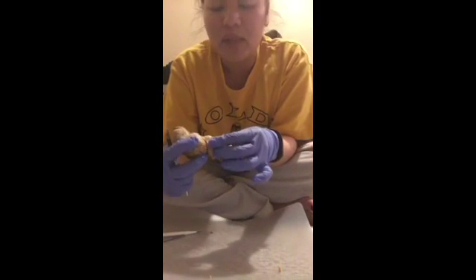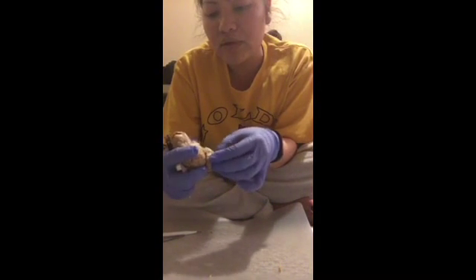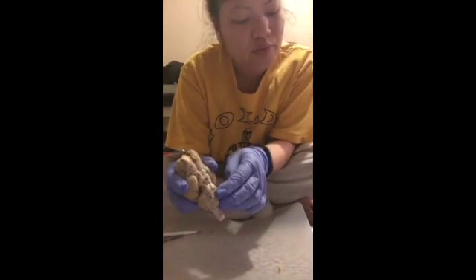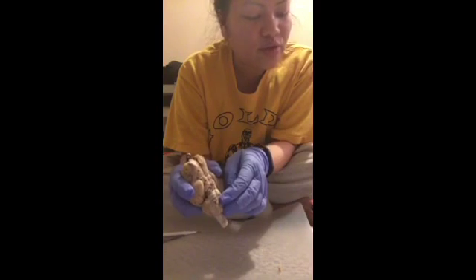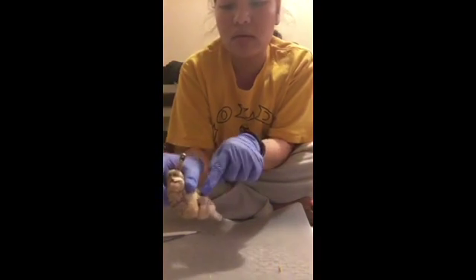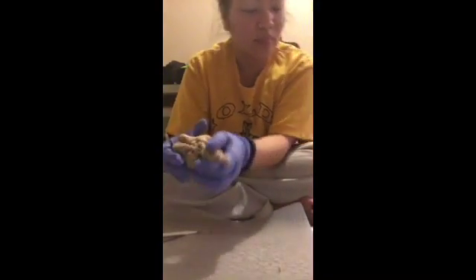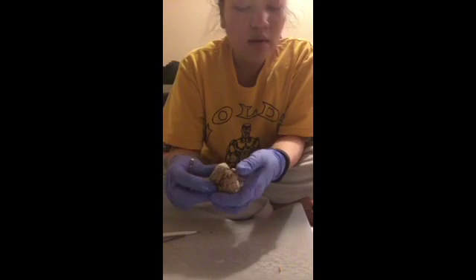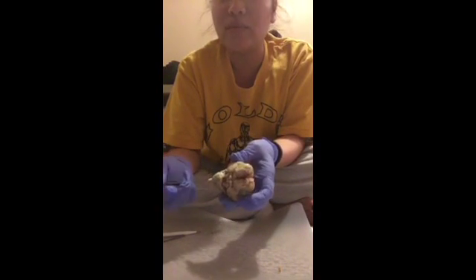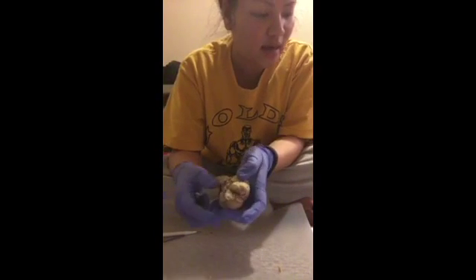It's hard to see. And then the abducens, they're the ones that are right here. The little ones sticking out, they're the abducens. The trochlear is somewhere around up here. It's hard to see. Sorry, like right there. It's very hard to see because they're really thin. Unless they're colored, that's the only way it's going to be easier to see. So I try to point it out as much as I can.